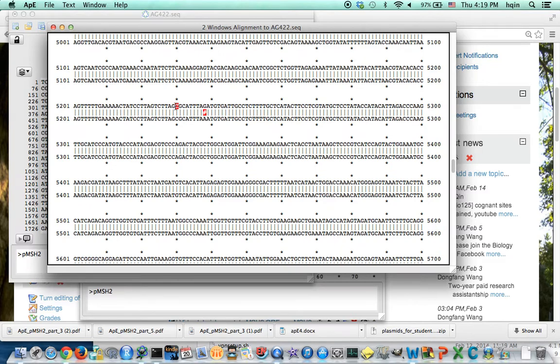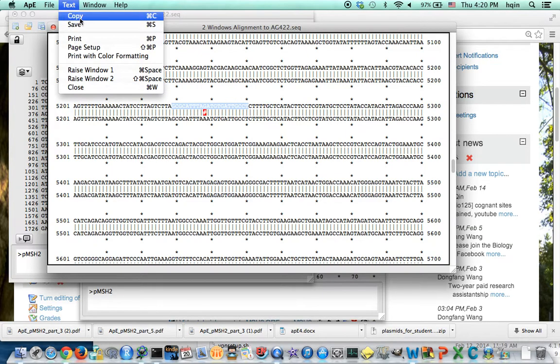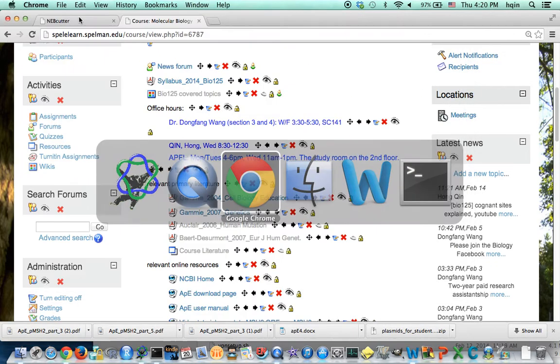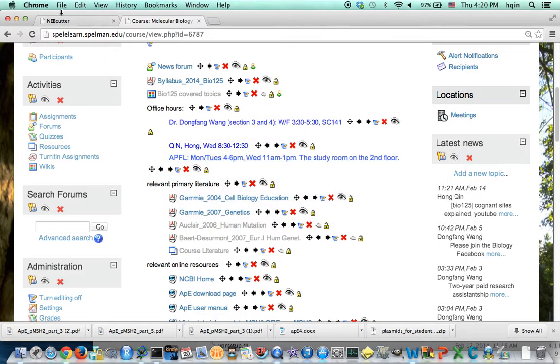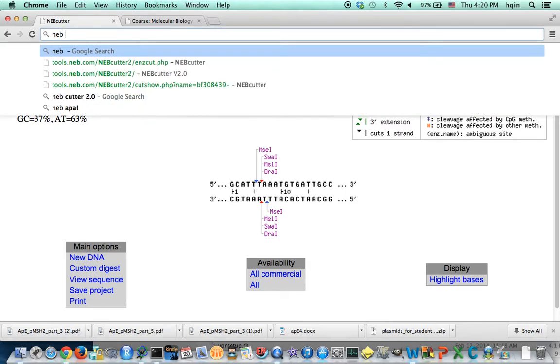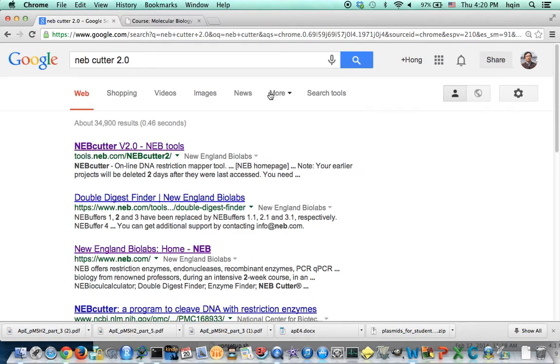So let's first start from the top, about 10 at the top. I highlight everything, go to text, copy, and then I'm going to go to a site called NEBCutter. So if I just Google NEBCutter, it's going to take me to the site.